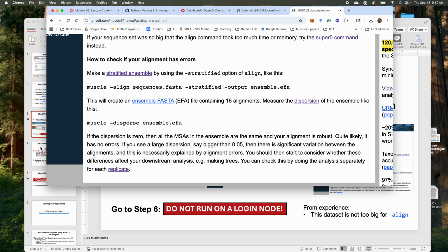Yeah, I was going to say you would tab all the way back to muscle. Yeah, because I don't know. Oh. And then hit tab, yeah. I'm sure there's a reason, I just don't know it. Oh, all that stuff happens. So that's why I was going to say, delete that. Yeah. And then only copy the second. You'll do the P450.